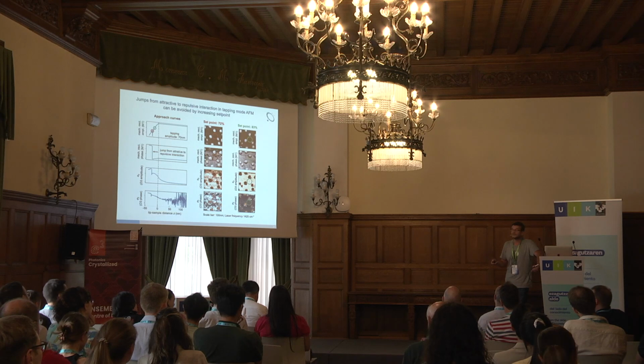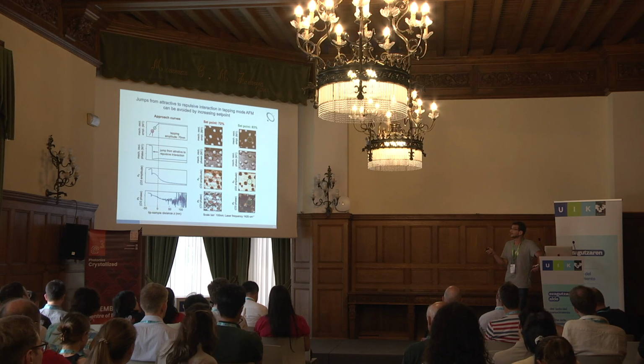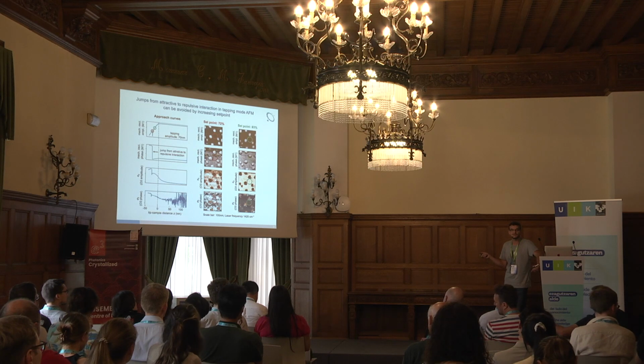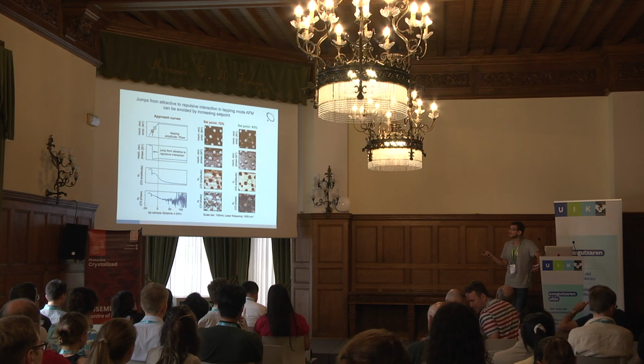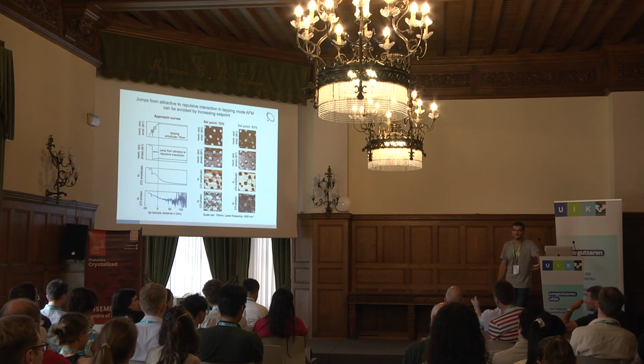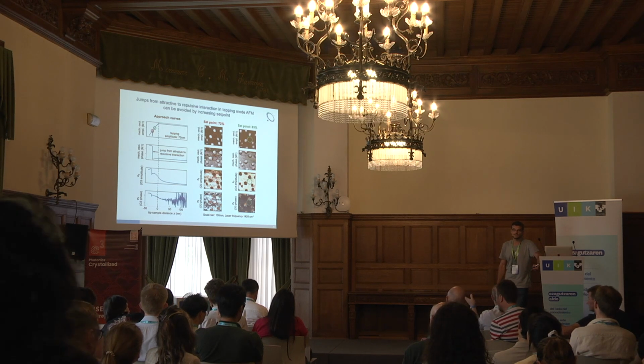You could even change the driving force while scanning. This is now completely disabled. That gives you a lot of access to fine-tune this mechanical tip-sample interaction, which is really important, particularly for a little bit complicated sample. Because depending on the radius of the tip, you may change the set point, maybe not enough.